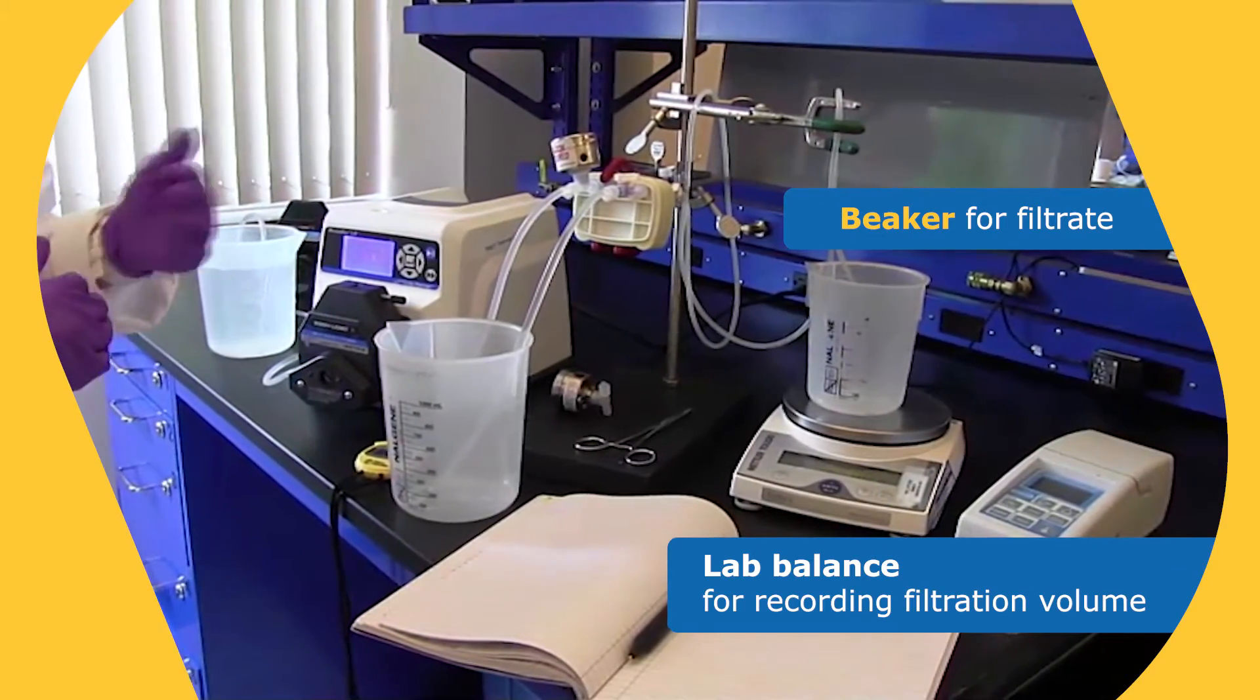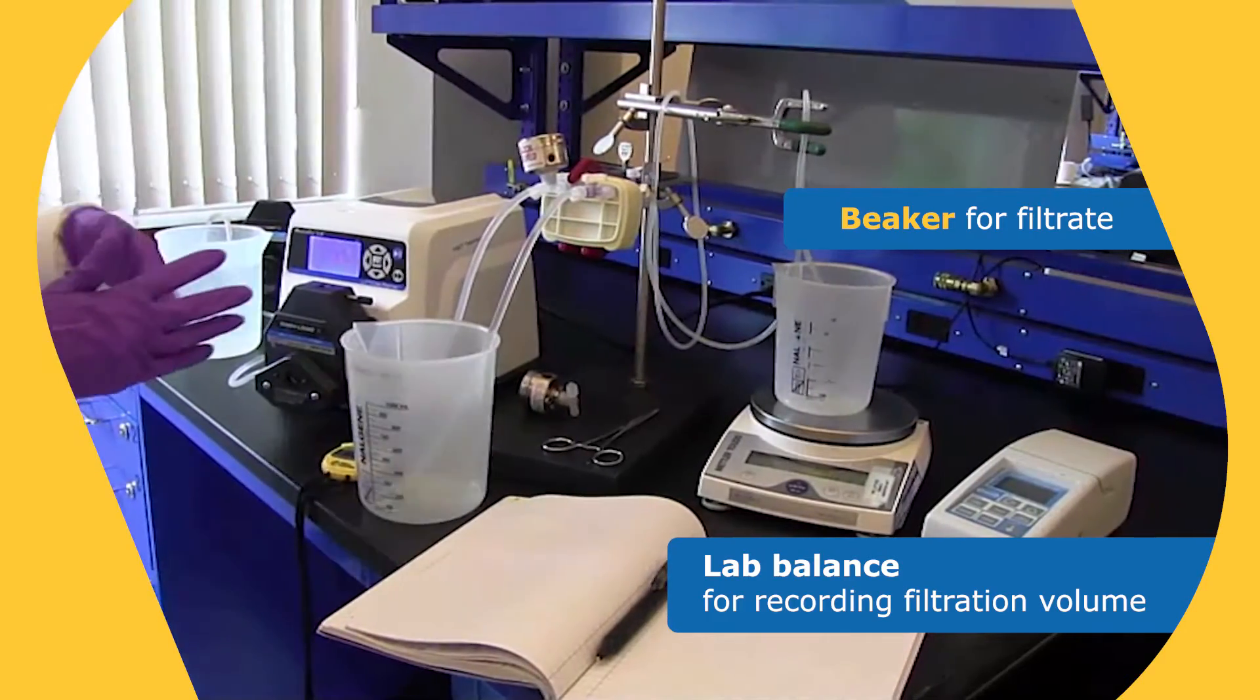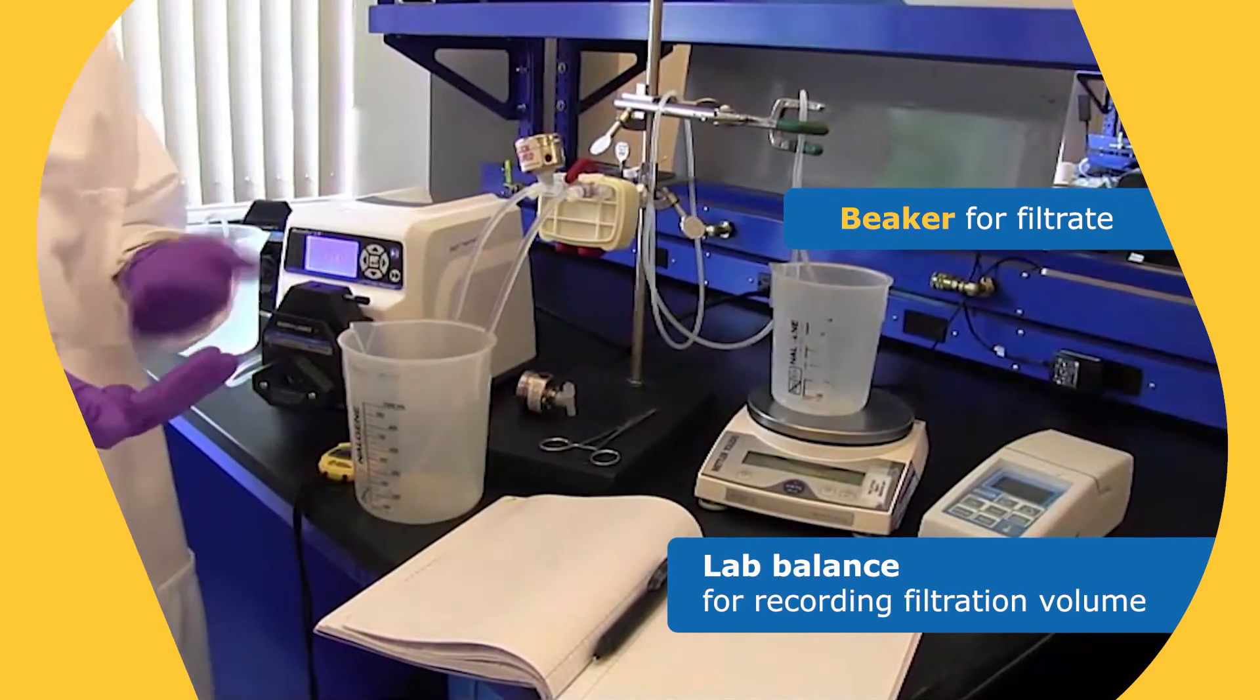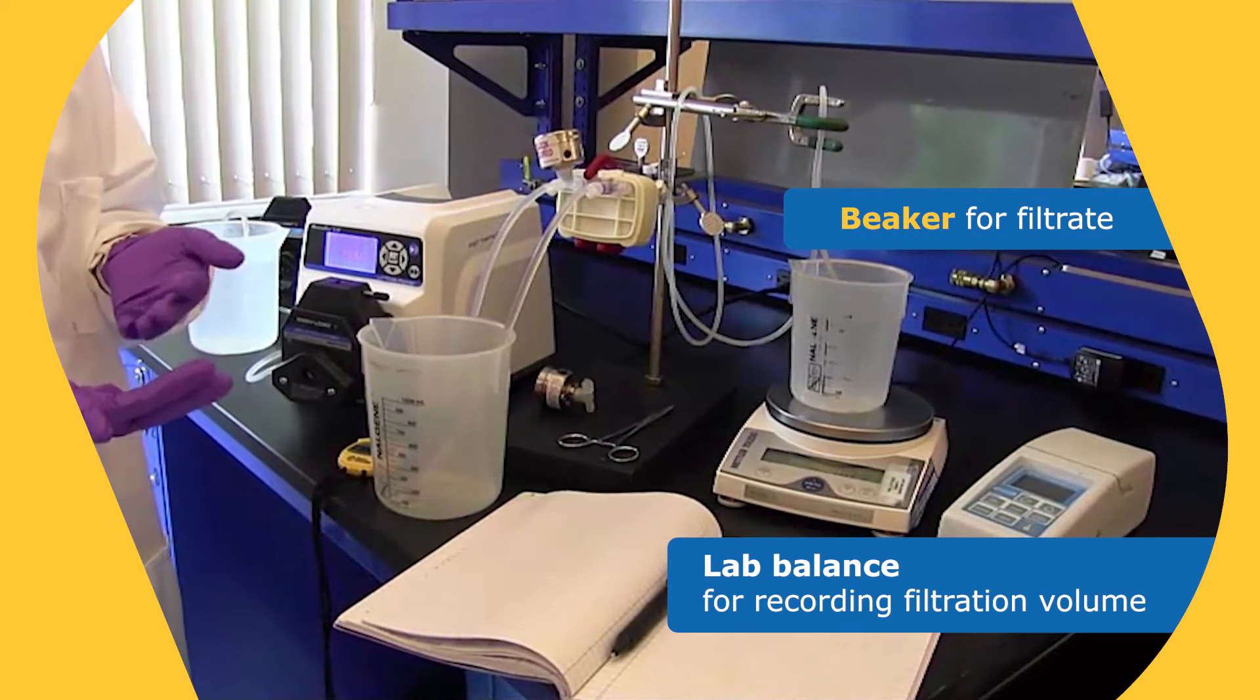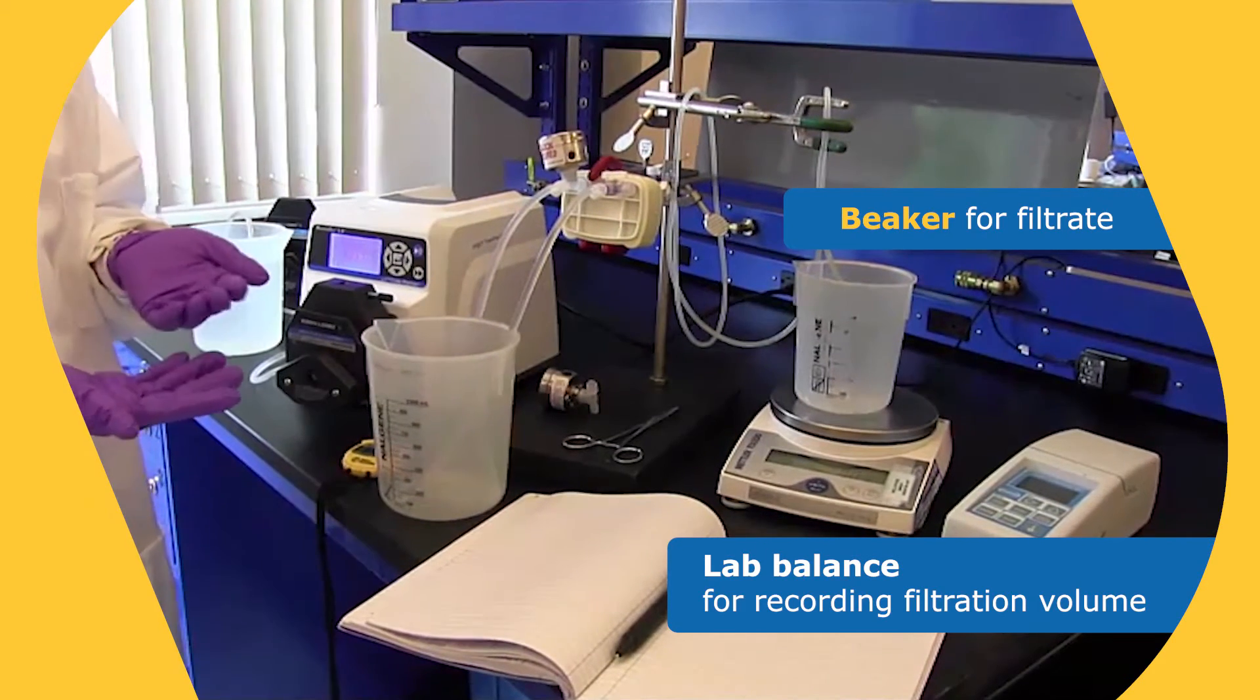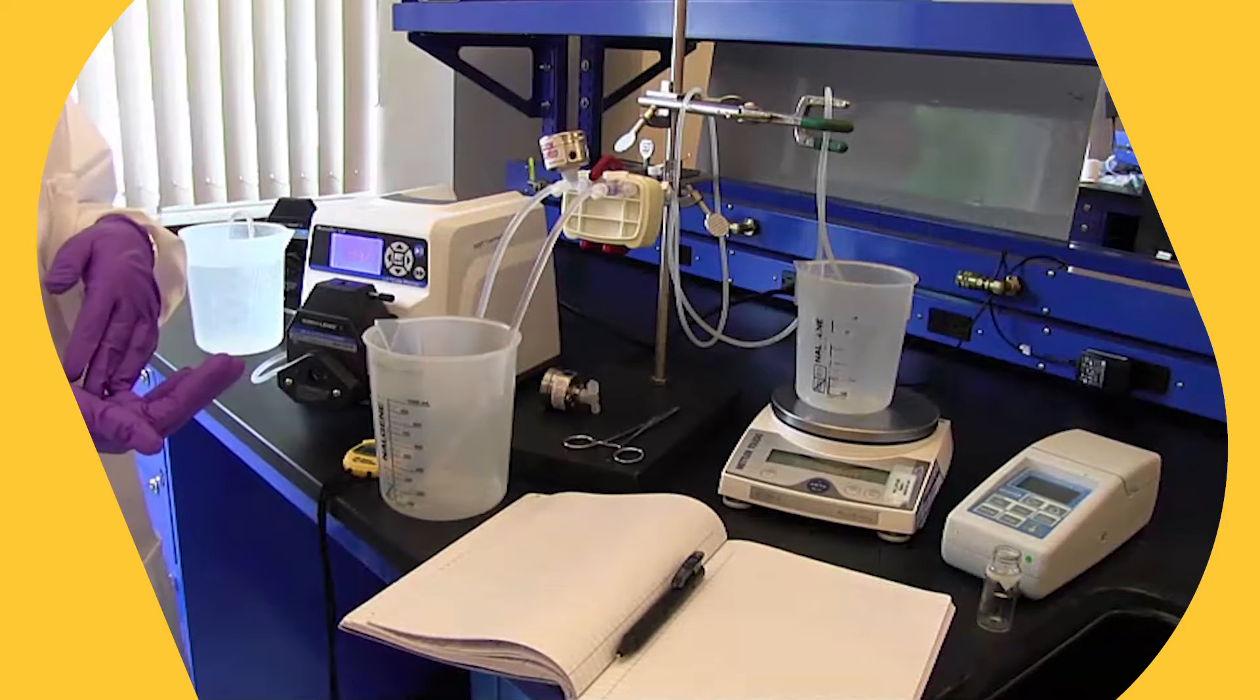With that said, oftentimes we assume that the fluid we're testing is close to water, so the density would be around one. But if you know that your material would have a different density, that would be good to record. And again, that would be accounted for in the data analysis section.